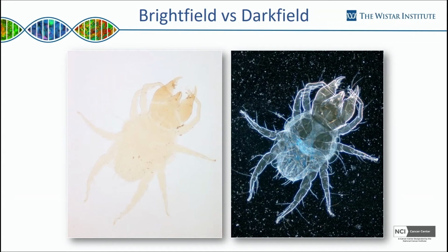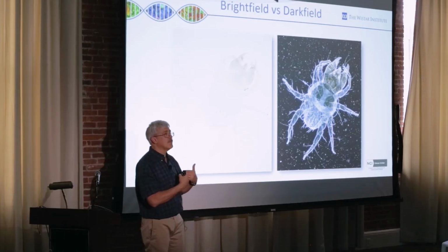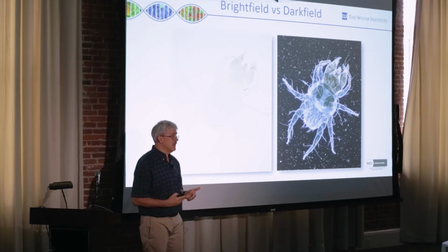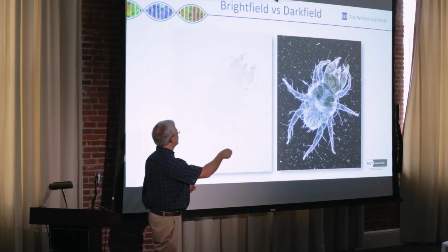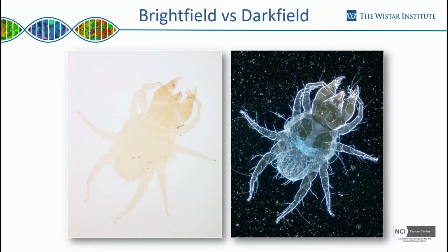But this is not stained on the right. The contrast adjustment is coming only from the optical enhancement that we've done. Now, the one thing about dark field that's really critical is everything's got to be clean, because all this crud shows up just as nicely as your specimen.